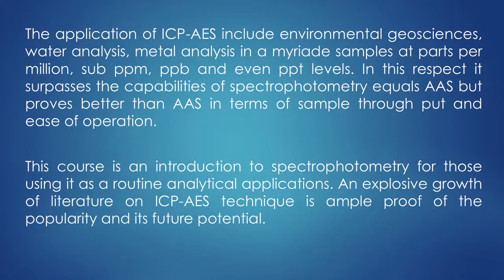That means you can do a number of samples in a very short time and finish the total analysis within no time. So, this course is an introduction to the spectrophotometry of ICP-AES for those who use it as a routine analytical application.